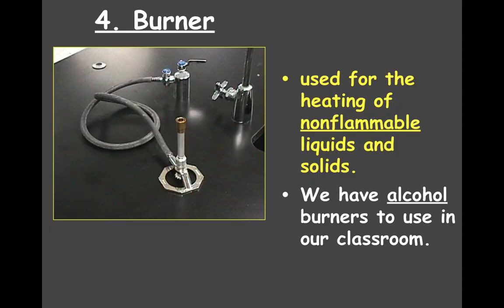The next piece of equipment we're going to talk about is a burner. A burner is used for heating of non-flammable liquids and solids. You never want to put anything flammable in there because it will immediately spark another fire. We have alcohol burners that we're going to use in our classroom, but they operate the same way.